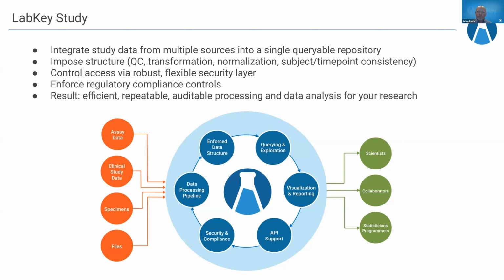Study also enforces regulatory compliance through the controls that we have built into LabKey and through best practices and documentation that we provide to our clients. And the result, really, this is the end goal, for your research data, it provides efficient, repeatable, auditable processing and data analysis for all of the data that you collect.